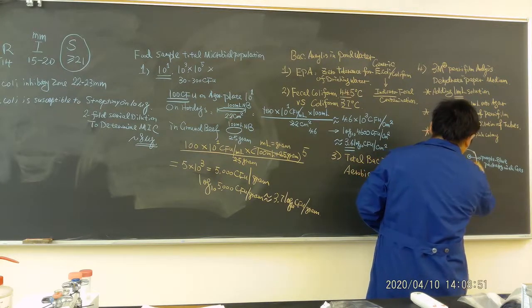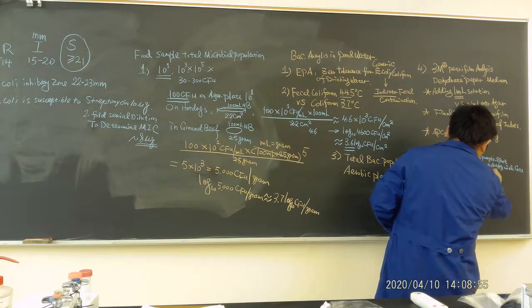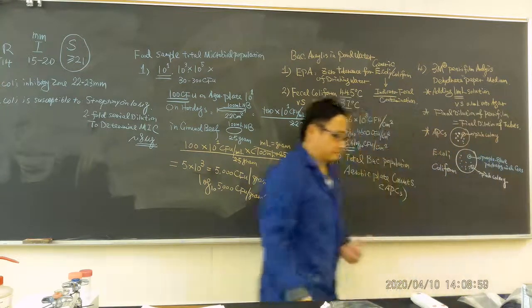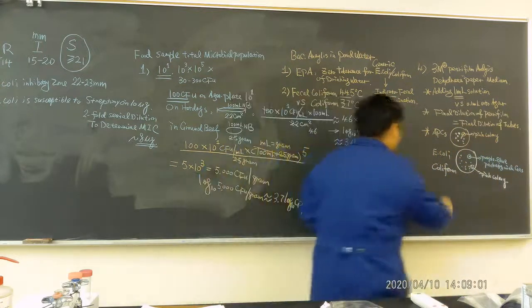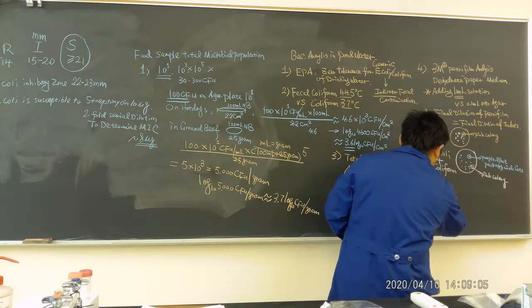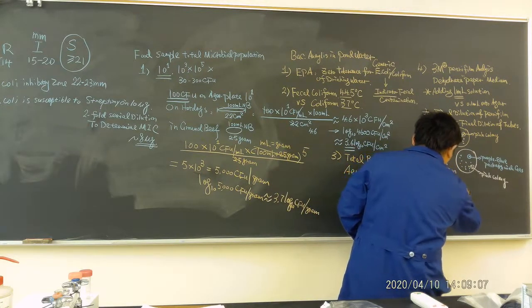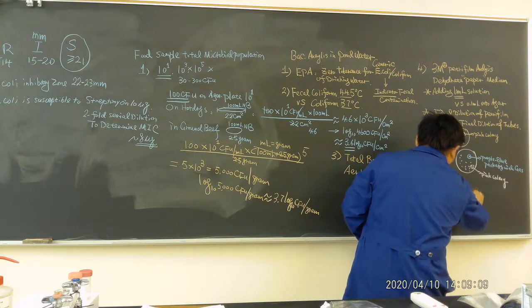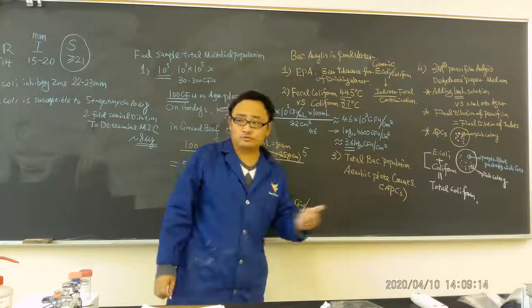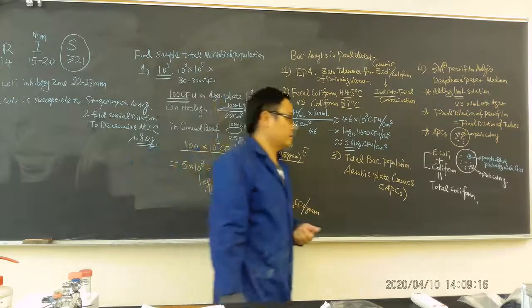If you see some of the pink colonies, that is coliform. Now, what is total coliform? You're going to add them together, and that equals total coliform. Okay, so that's what is most important there.